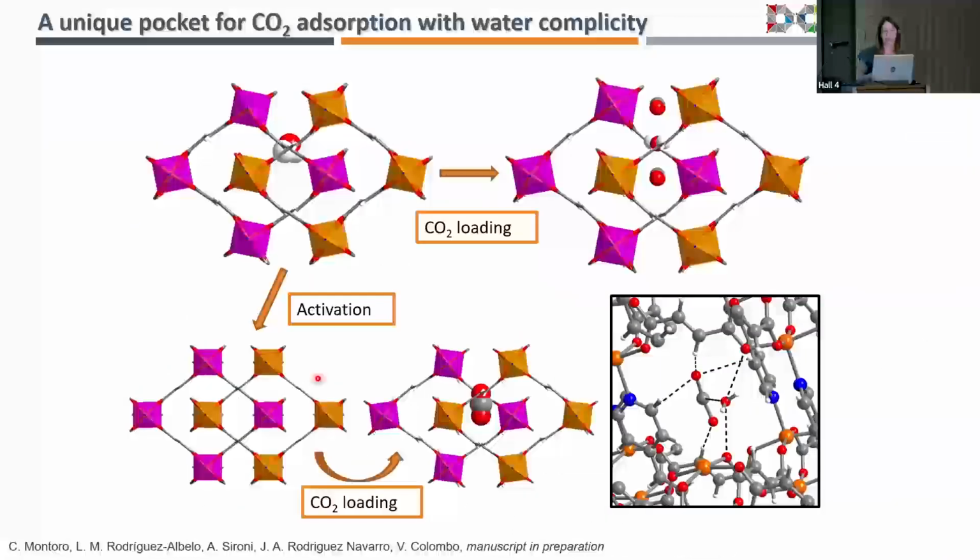So this is just a summarizing slide to show you that you can perform CO2 loading, activation, and then again, CO2.